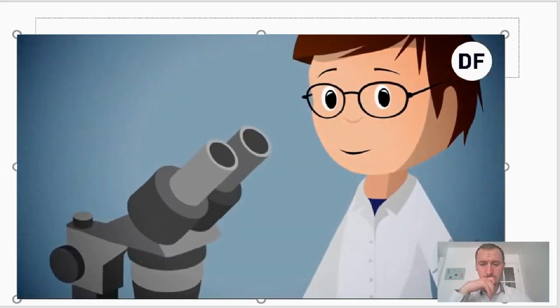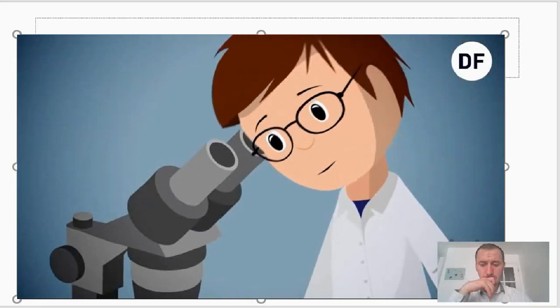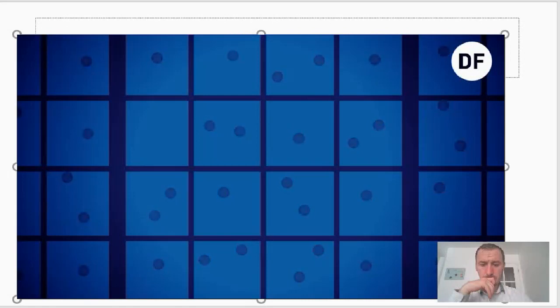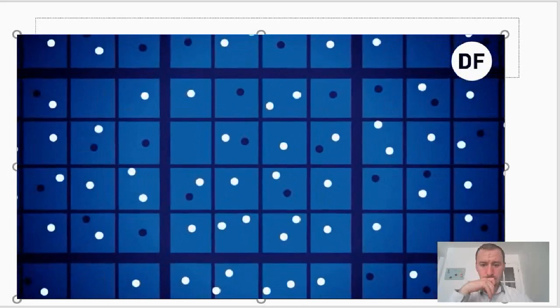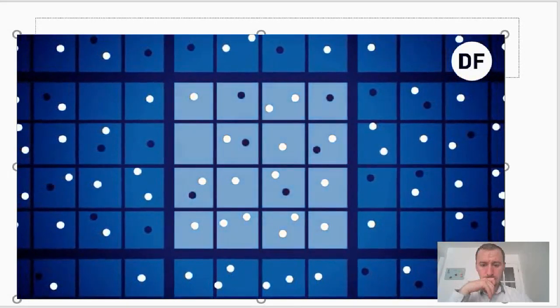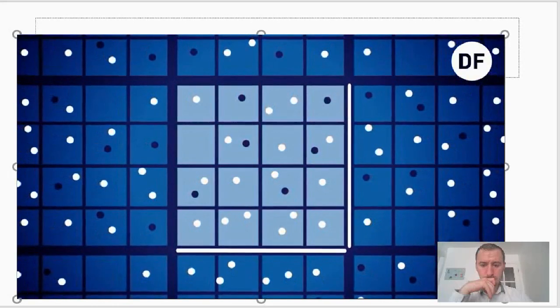With a microscope and a 10 times magnification, you will be able to see approximately 1 square per viewing window. Use phase contrast to distinguish the cells. Live cells will not be stained by trypan blue and will appear white, while any dead cells will be faint or dark blue. Now you can count all the cells that fall within a couple of the larger squares and include any cells on the right hand or bottom boundary line.